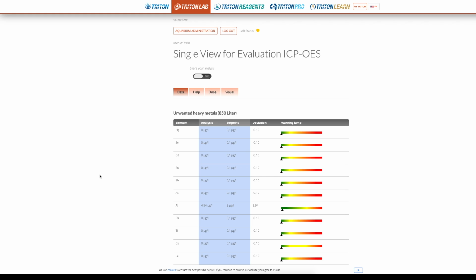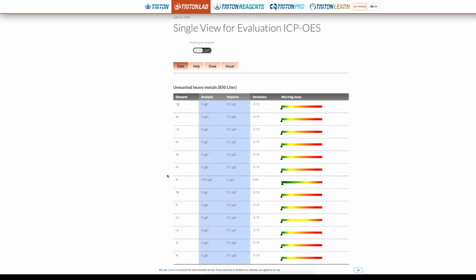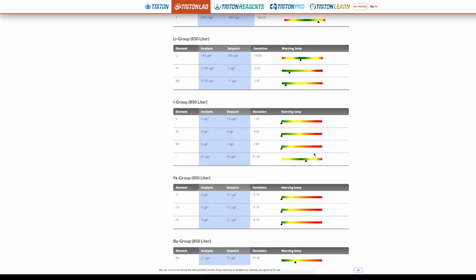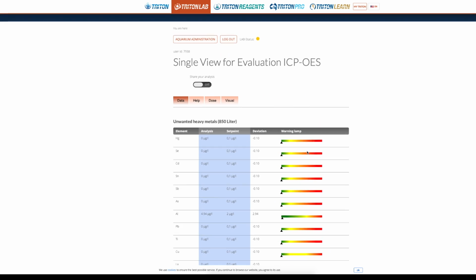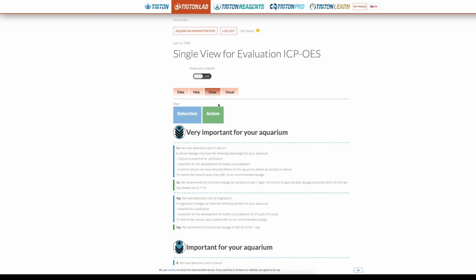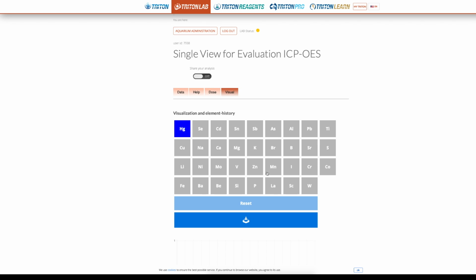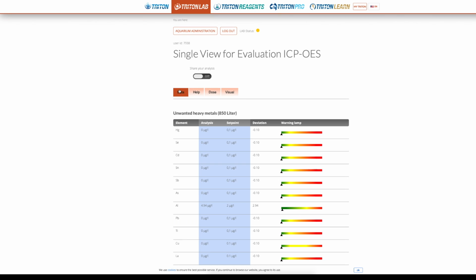So I guess we'll start off by showing the overview you get. This is the Triton one. It gives you a list of the element, what the analysis is, the set point, what the deviation is, and this little warning lamp to show you whereabouts on that spectrum you are. You also get some dosing instructions if you're using their elements, and then a visual you can compare your test results over time.